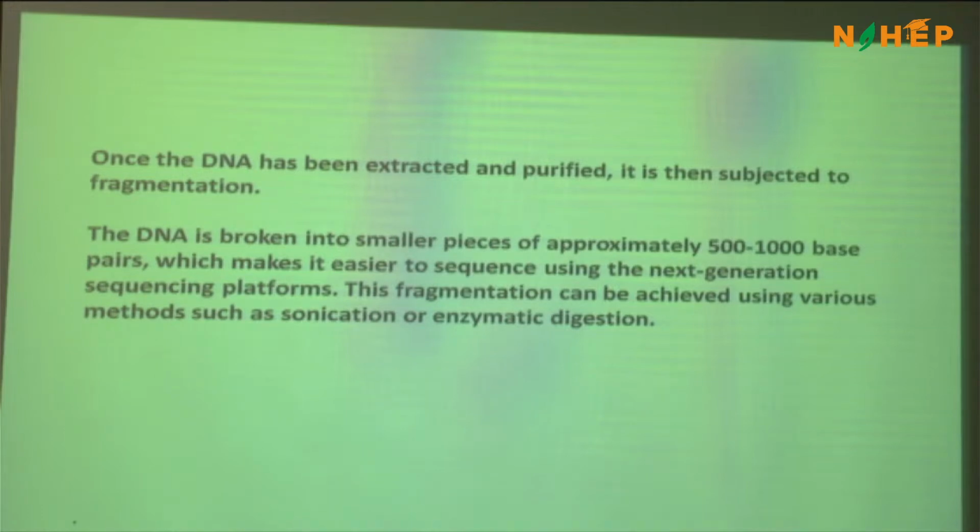Then after DNA isolation, it goes into the sequencing pipeline using machines. The choice of the machine depends upon your type of objectives. It could be short read sequencing or long read sequencing. It could be even metagenomic sequencing by shotgun. A variety of tools are there.